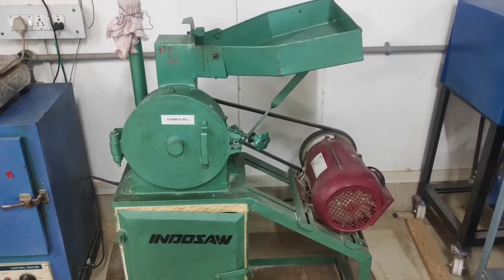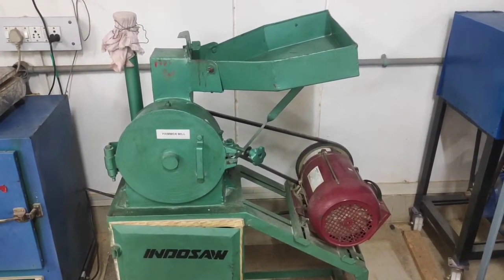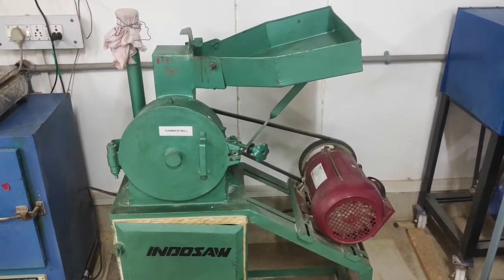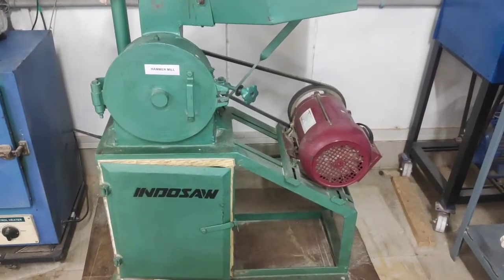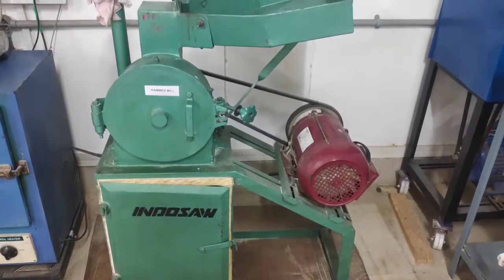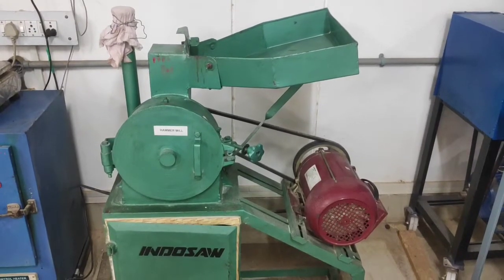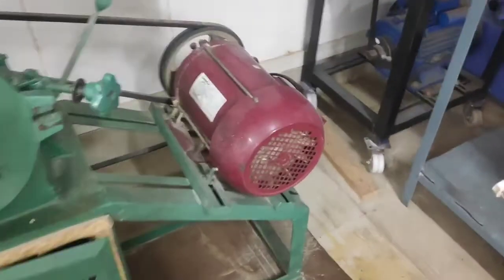The aim of today's experiment is to evaluate the performance of the hammer mill and calculate capacity, efficiency, and power requirement for the milling. The mill we are seeing is developed by Indosaw Industries, model number LM200LK3198.